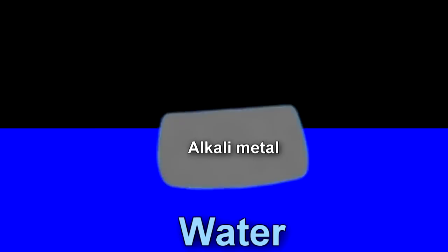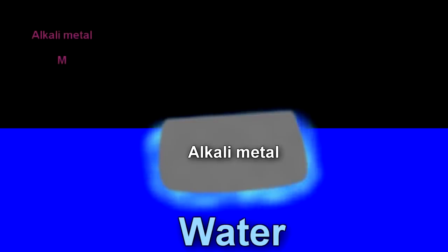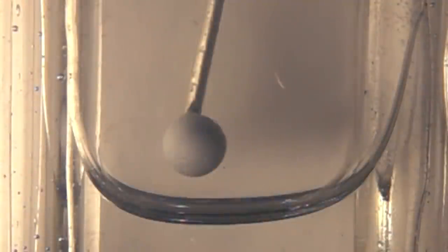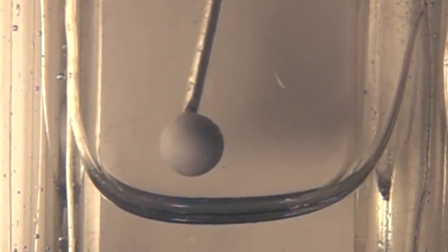I'm sure it was kind of cute, but the non-explosive reaction of the alkali metals when they're just generally put onto water, that's got to be pretty straightforward, right? Well, I don't know. Let's take a look up close and personal and under an argon atmosphere filmed at 1,000 frames per second.